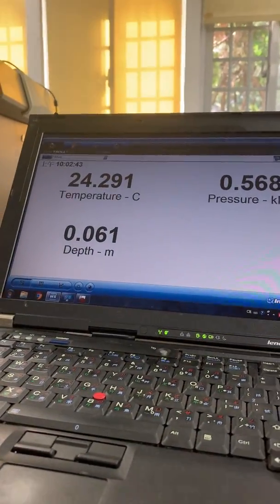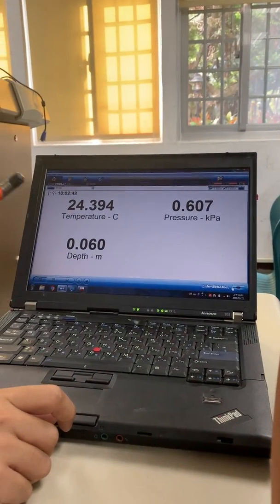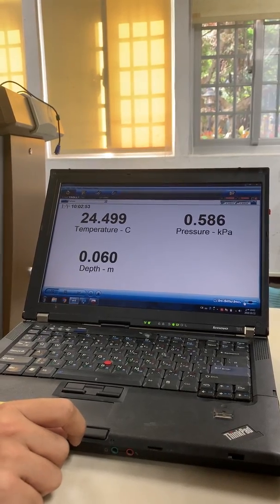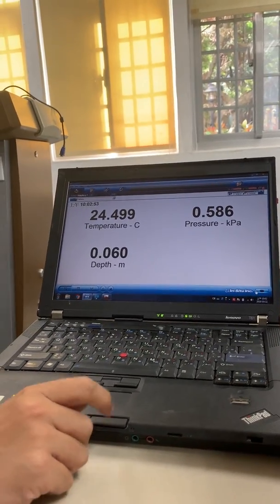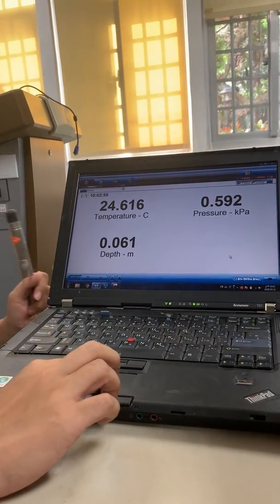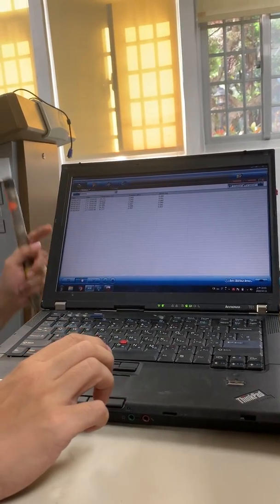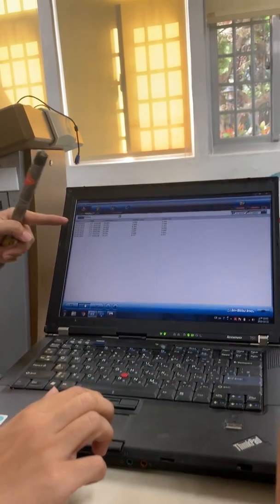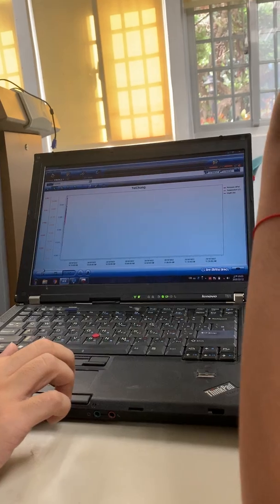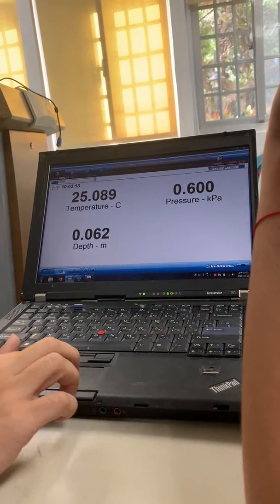This is the Small One Level 2 device. You can measure temperature and depth. The temperature is 24 and depth is 0.06. There are several buttons: this one shows only numbers, this one only the finger indicator, and this one only the current value. Select whichever you want to use.